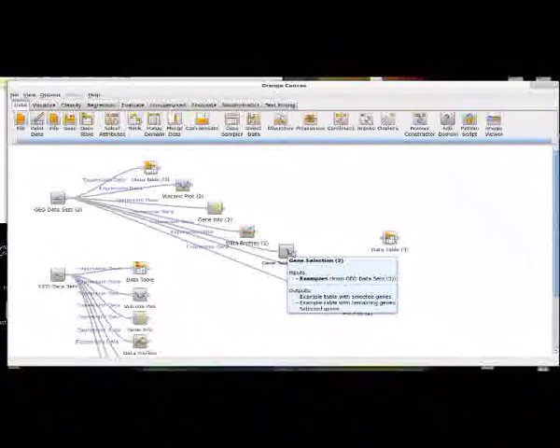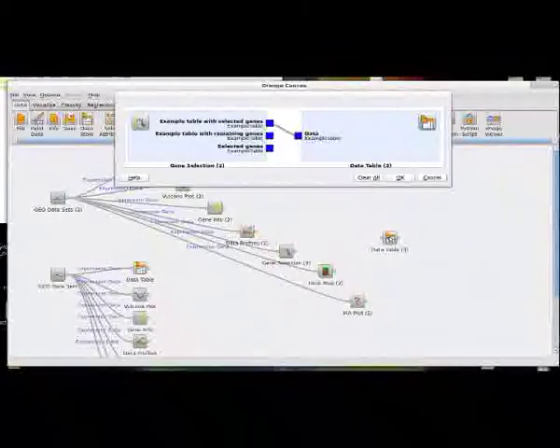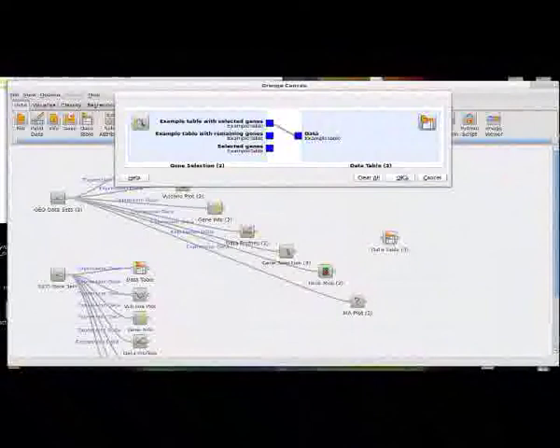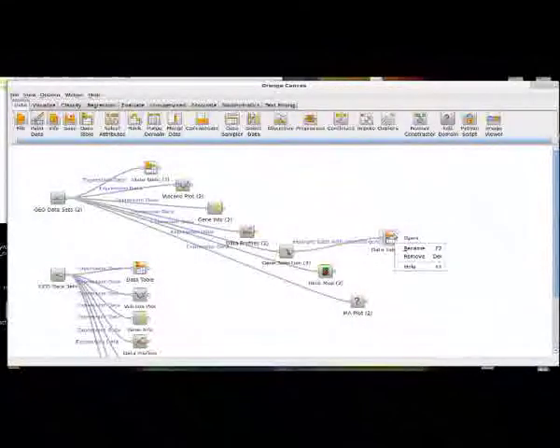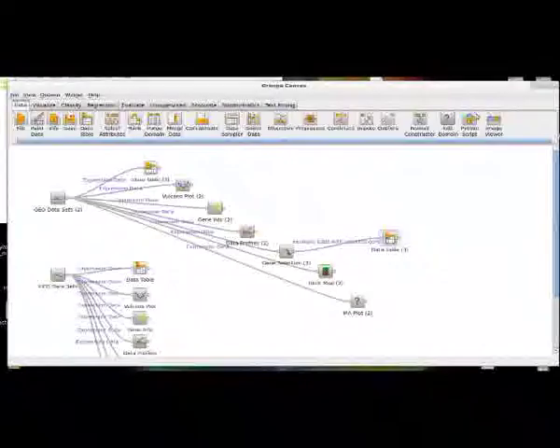So let me drag this over to a data table, and I want the selected genes, and let's look. So these are three genes that that widget, based on its scoring function, found interesting in relation to its effect on liver tissue, as far as how the expression in those three genes in liver tissue is so significantly different than that of other tissue types. So this is a glorious widget right here.